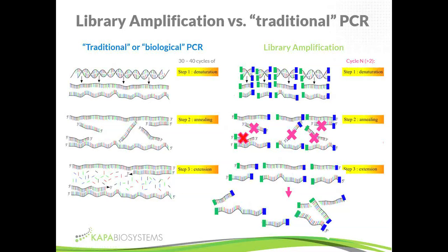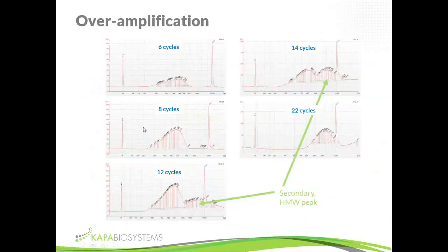The DNA wants to stick. DNA doesn't like to be single-stranded. These library molecules only have their adapter sequences in common, and so molecules that don't belong together will start sticking to one another by means of the adapter sequences. They create what we call bubble molecules, tangled knots, or heteroduplexes of some sort. These end up being big balls of DNA that are partially double-stranded, partially single-stranded.